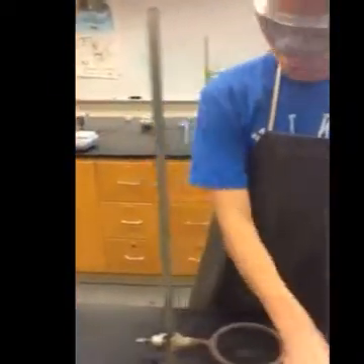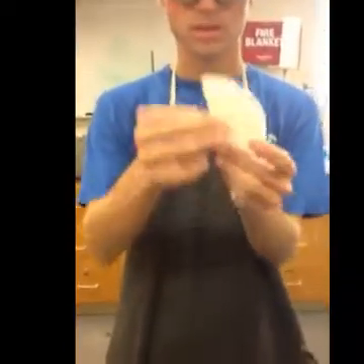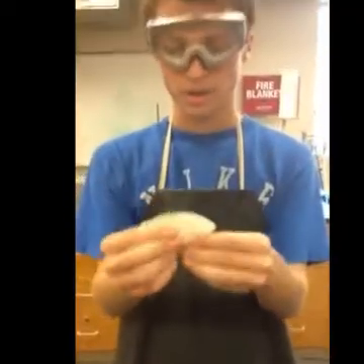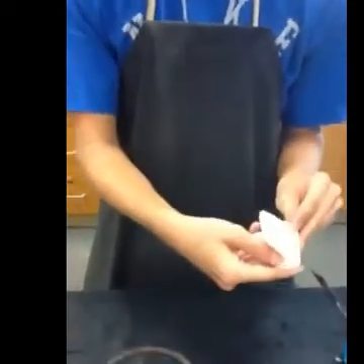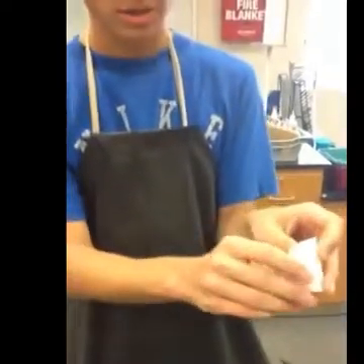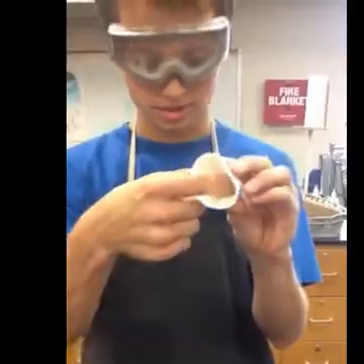So first off, you are going to take the filter paper, fold it in half — see I have filter paper here — and fold that in half again. Now you're going to open it back up, but make sure you don't open it like this or else you won't be able to filter all the way through. You need to open it up so that there's one side of filter paper on one side and then three sides on this side.